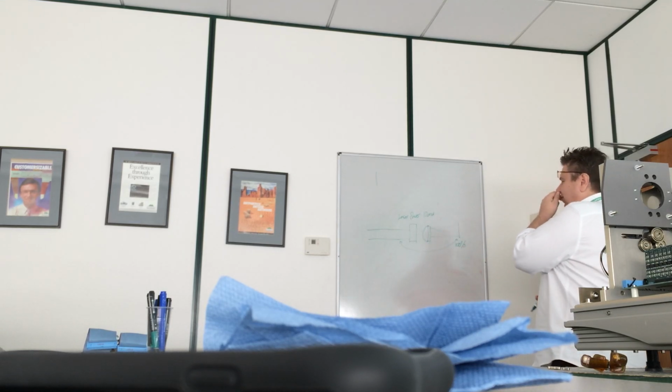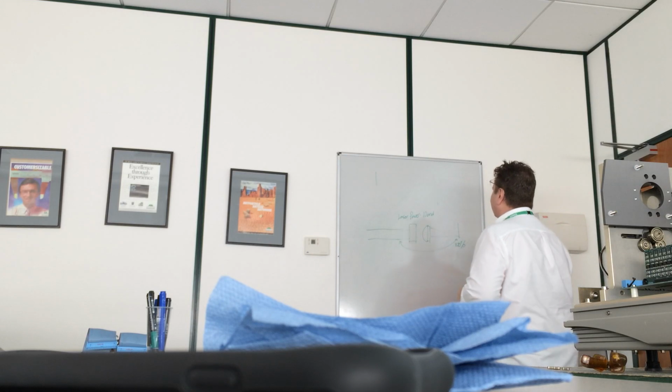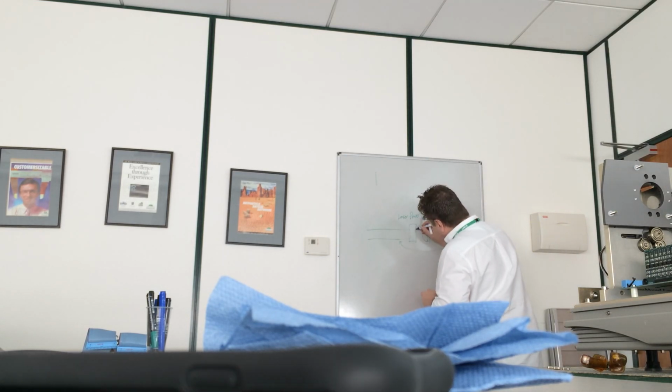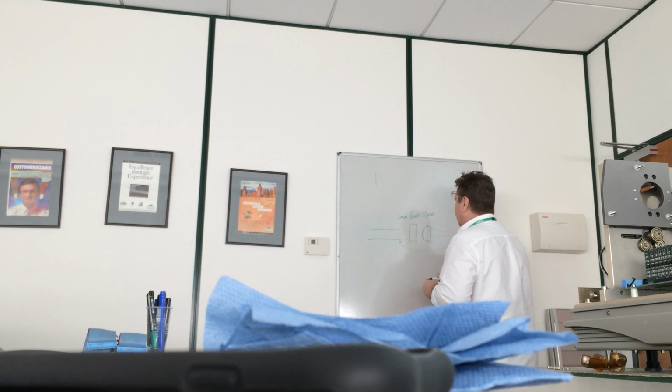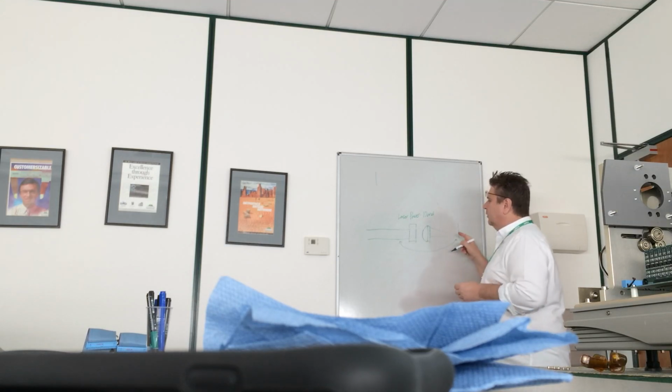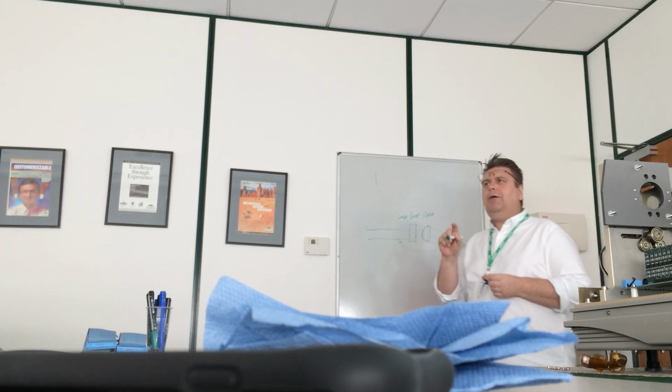Unfortunately, there's no such thing as an ideal world. So, unfortunately, sometimes you get dirt on the cell windows, dirt on the lens. So your transmission drops down to, say, 90%. We're only detecting 90% of the laser at the background level. This is before we had sample.